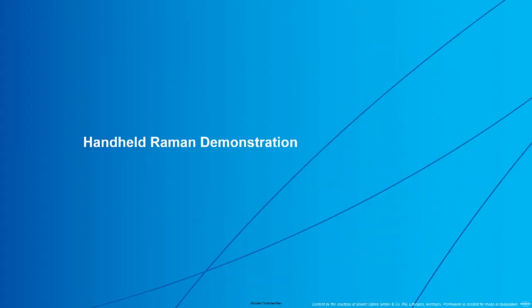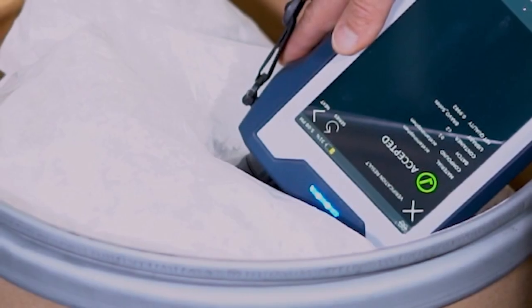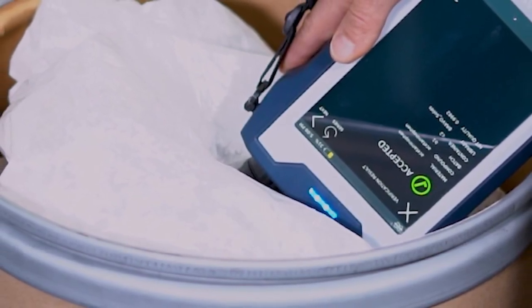So with that, I want to close the presentation so that you get a clearer picture of how a handheld Raman spectrometer can be used, how flexible it is. We prepared as well a small video demonstration. Enjoy it.